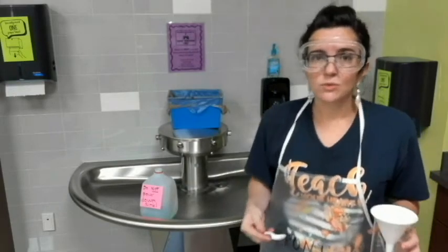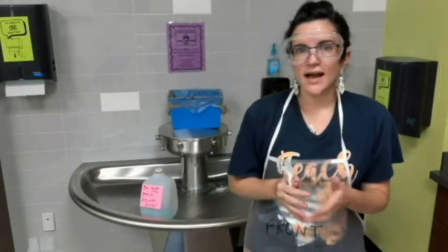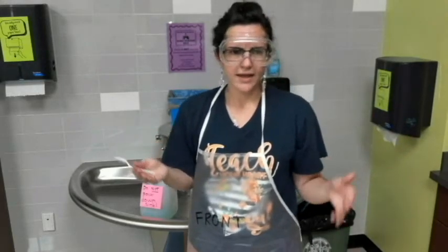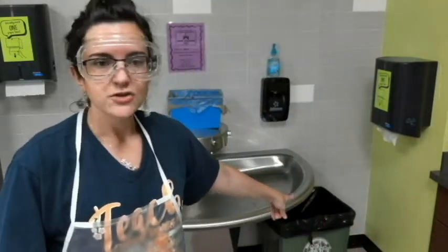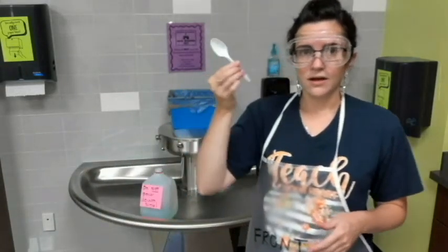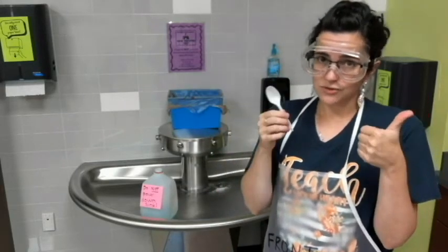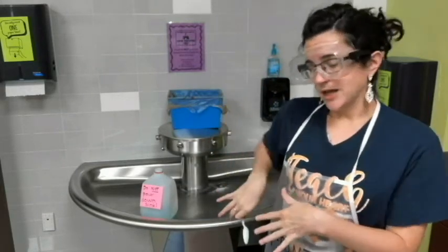Now let's say you're washing your hands, kind of like in the bathroom. You have paper towels. Those are okay to throw away, and we'll always have some sort of trash can by the sink area for you to throw away any items that are given to you in the instructions that yes, it's okay to throw away completely in the trash can.